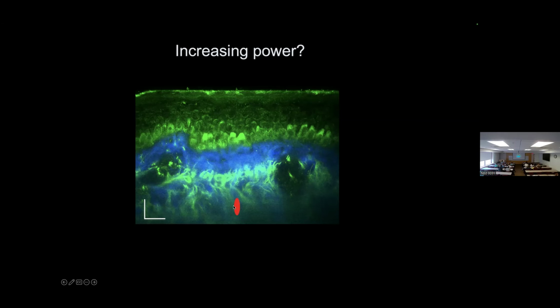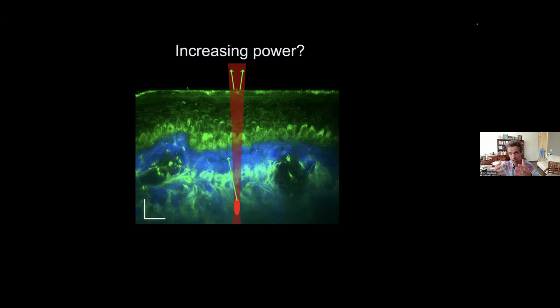So I want to crank up the power. I can do that, and a lot of people do that. I'll lose photons, but if I just send more in, then in the end, I get the same amount where I want them to be, okay? And so then I collect the fluorescence from that spot regardless. But the problem is, if you do that, then you have to send more photons from the top here. And at the top, there can be so many photons going in that you start generating signal from the top as well, okay? So the flux is so high that out-of-focus two-photon excitation actually starts to come up.